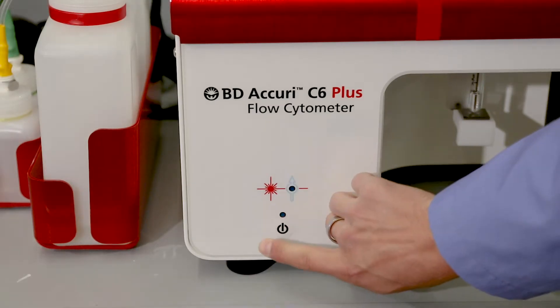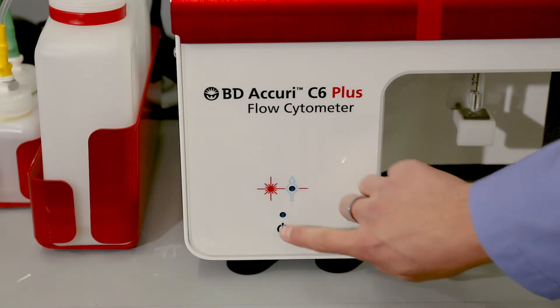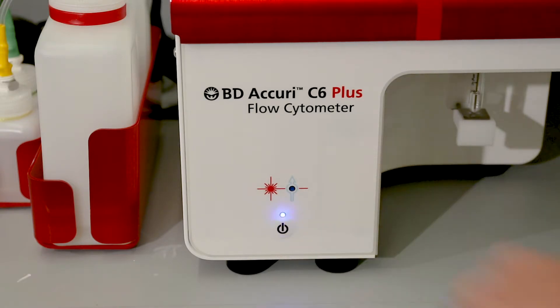Push the power button on the Acuri once. The machine should turn off. Push the power button on the Acuri again. The machine should power up and enter startup mode. If startup does not finish within another 20 minutes, please contact a technician.